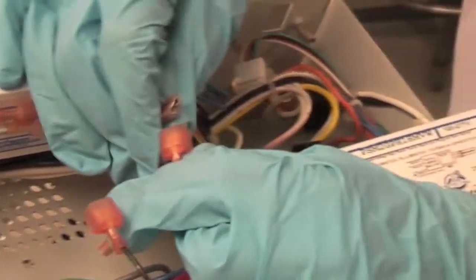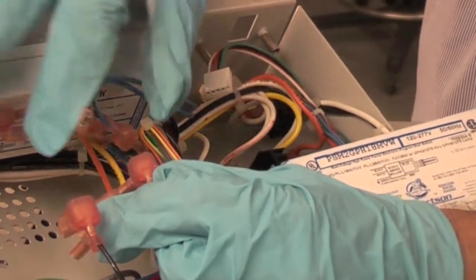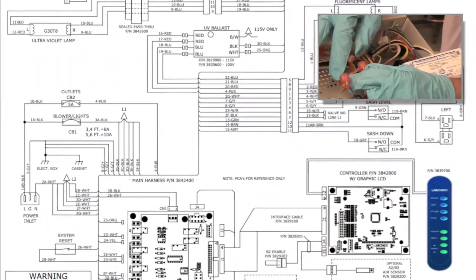Wire the UV ballast into the wiring harness following the wiring diagrams that can be found on labconco.com.